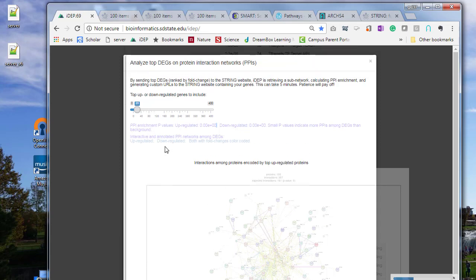As I tell a lot of biologists, p-values measure the significance or the certainty about the differential gene expression, but the size of the effect, how much a gene is up- or downregulated, is measured not by p-value but by the fold change.